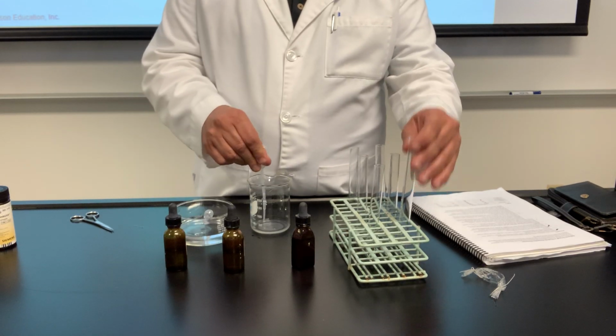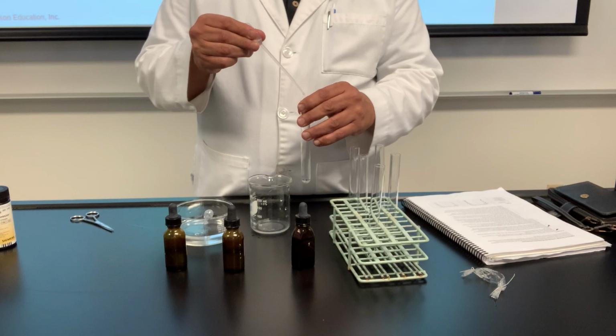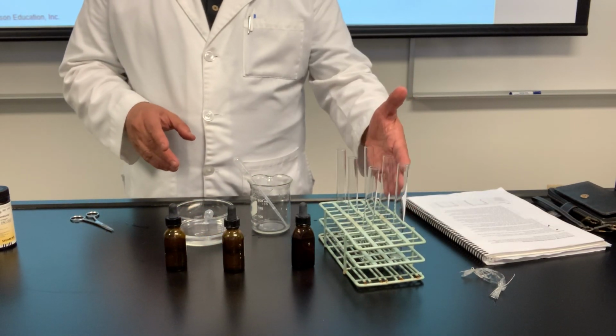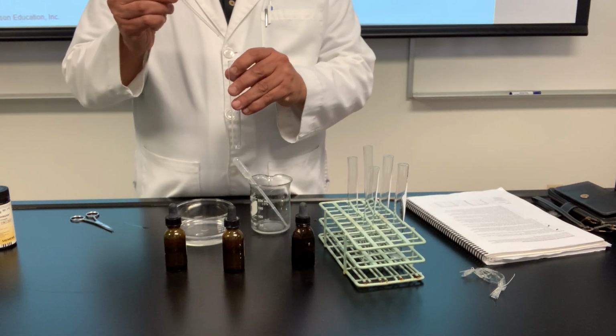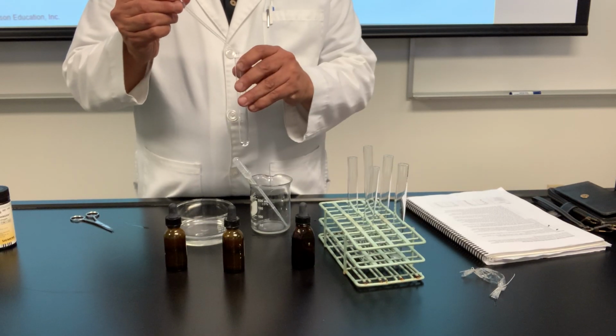And this time, 2. Okay, notice that I only put the inside solution in here, and I'm going to do the same thing with the outside solution. Because we're about to test them to confirm if our predictions are correct.